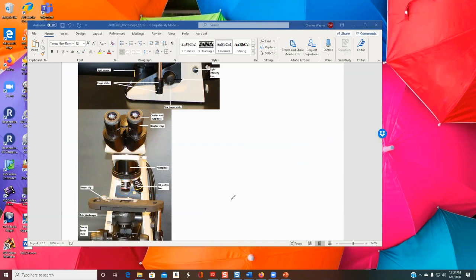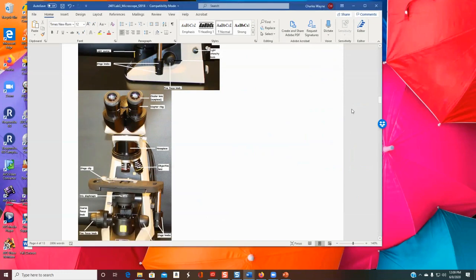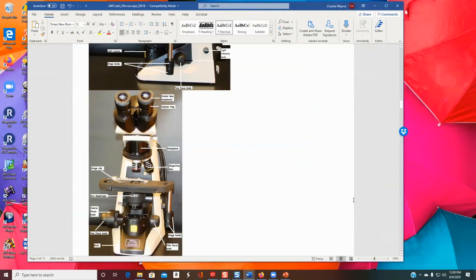All right. Now there were some principles involved here. Maybe we can just stay with this, because this is kind of big on the screen here. We don't have to go bouncing back and forth, but I want to make it a little bit bigger. Yeah, 0.65 sounds absolutely correct. 0.65 is the numerical aperture.